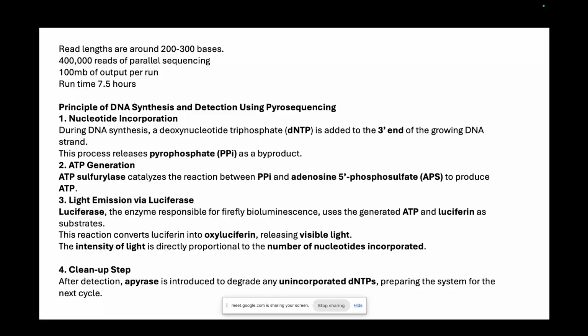So it can count one less or one more. If that happens, then during later data analysis, when you do alignment with the reference genome and then call variants, spurious indels of 1 or 2 base pair length will be incorporated because the number of bases counted was less or more.